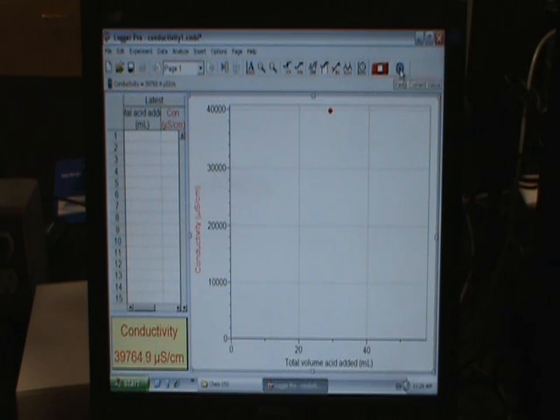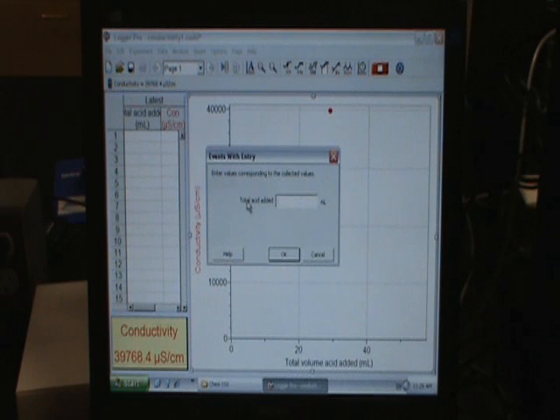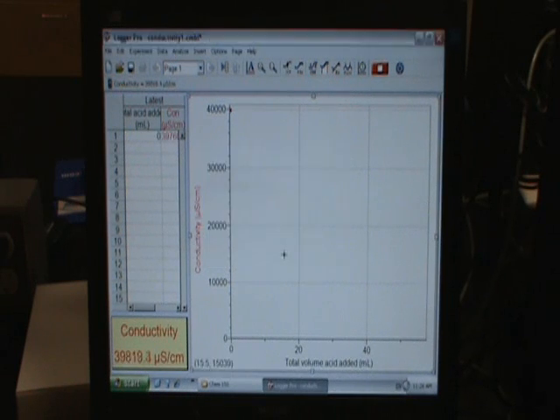So if I click keep, a dialog box will pop up and I'll tell it total acid added, zero milliliters. Okay. It just put the first point on my graph. So now we can get started on the experiment.